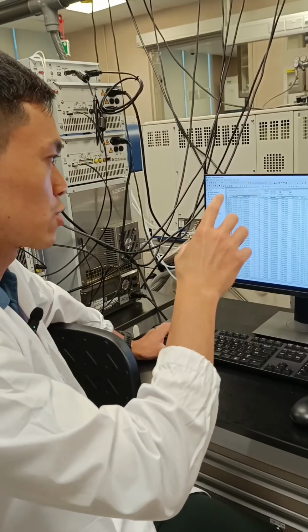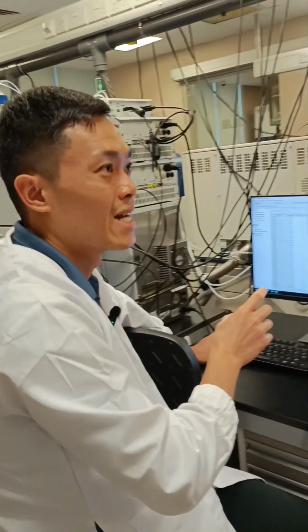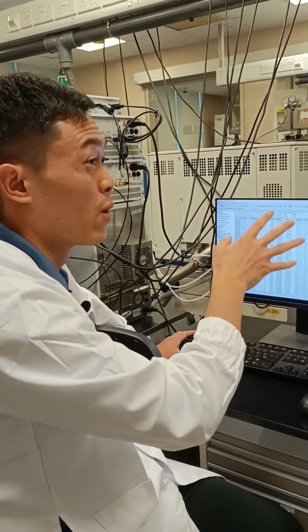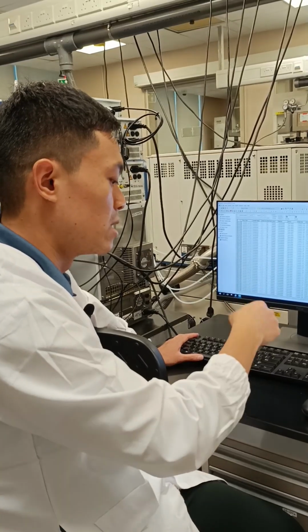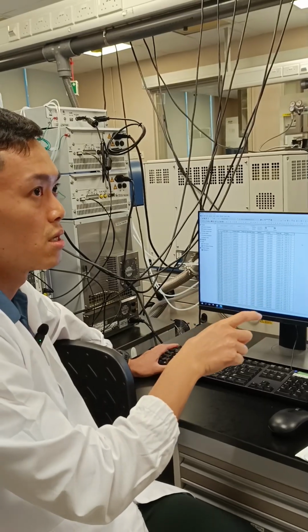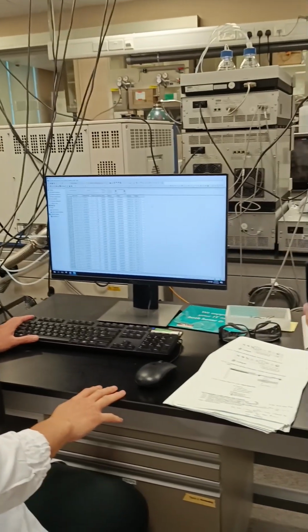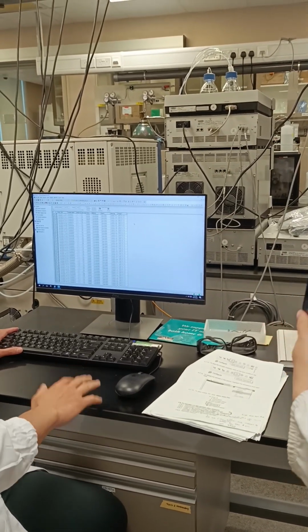Just to make sure, because with the bigger flow rate, I assume it cleans better, right? And then once I hit 1, I will just leave it for maybe 1 hour, to let it flush itself. Then only I switch it back to 75%, that's the column storage condition. So it depends on your practice. If you worry about the column getting contaminated, it's a good practice.